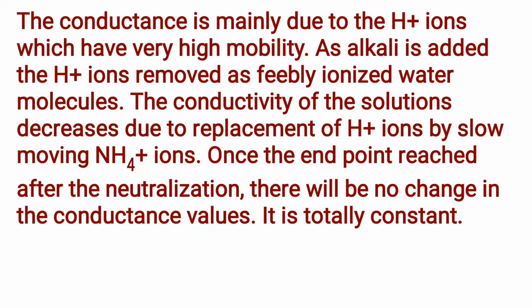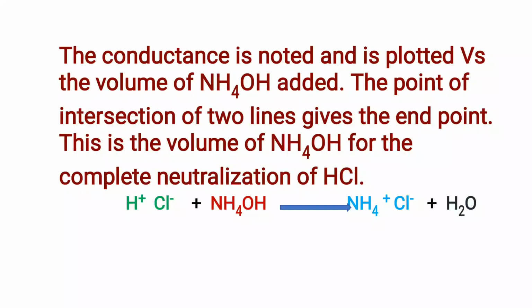It is totally constant. The conductance is noted and plotted versus the volume of ammonium hydroxide added from the burette. The point of intersection of the two lines gives the endpoint. This is the volume of ammonium hydroxide for the complete neutralization of HCl. The reaction is given below.